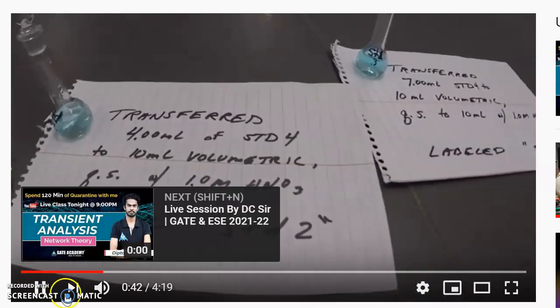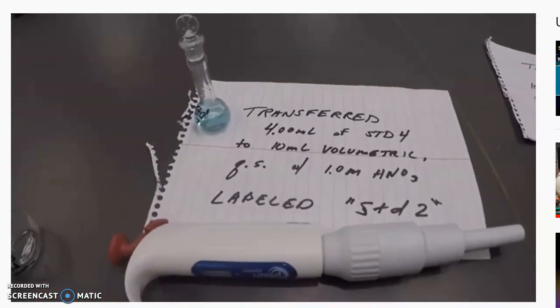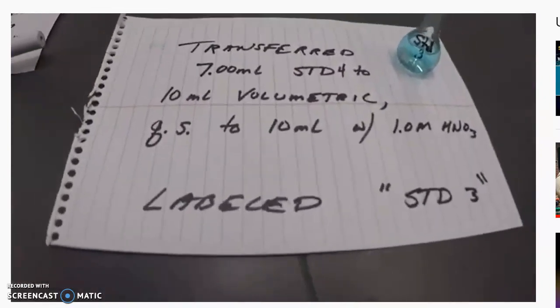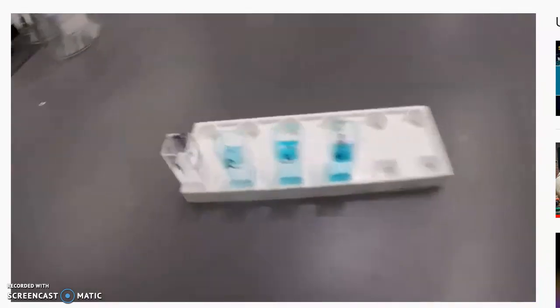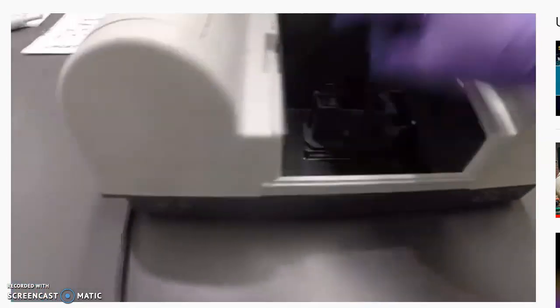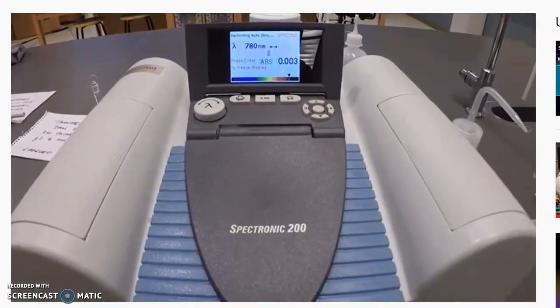So let me play this on. We used an autopipetter to do this transfer of the most concentrated standard 4. This is just showing how we made the other standards. And what we did was put them into, I say we, thank you, Mr. Davis, for doing this video for me. He put these into cuvettes, which are sample holding vessels that can go into the spectrophotometer. They don't absorb light or reflect it very much.